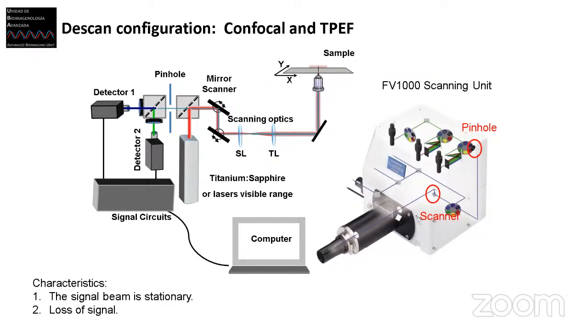So every fluorescent microscope has the tube lens. And when we want to do scanning, we have to have a scanning optics, scanning lens, that enables us to conjugate these two focal planes in a point and have the distance to the scanners in order to move the beam here. And then this guy will put the light back on the objective, doing basically the scanning without getting out of focus, right? This is the way that this works.